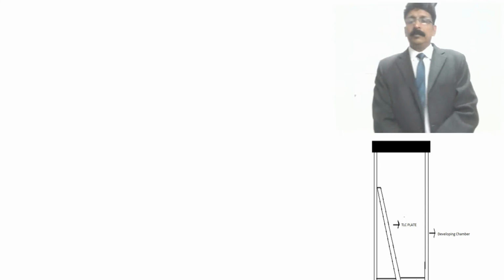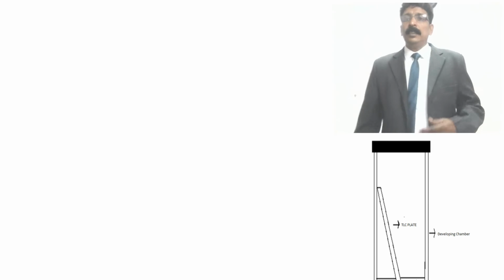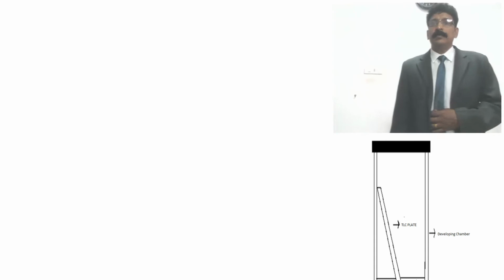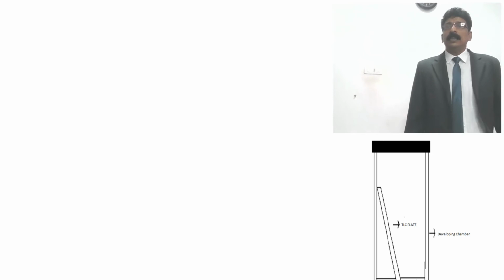We are just continuing with the chromatography class. I would like to continue with TLC, meaning thin layer chromatography.